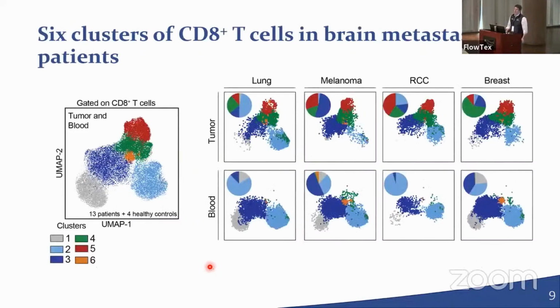But of course, it's very hard to look at N-by-N plots, as mentioned earlier, when you have this many colors. And so we did UMAP dimensionality reduction on this. And so the way that we collected these samples is that we freeze them, right?